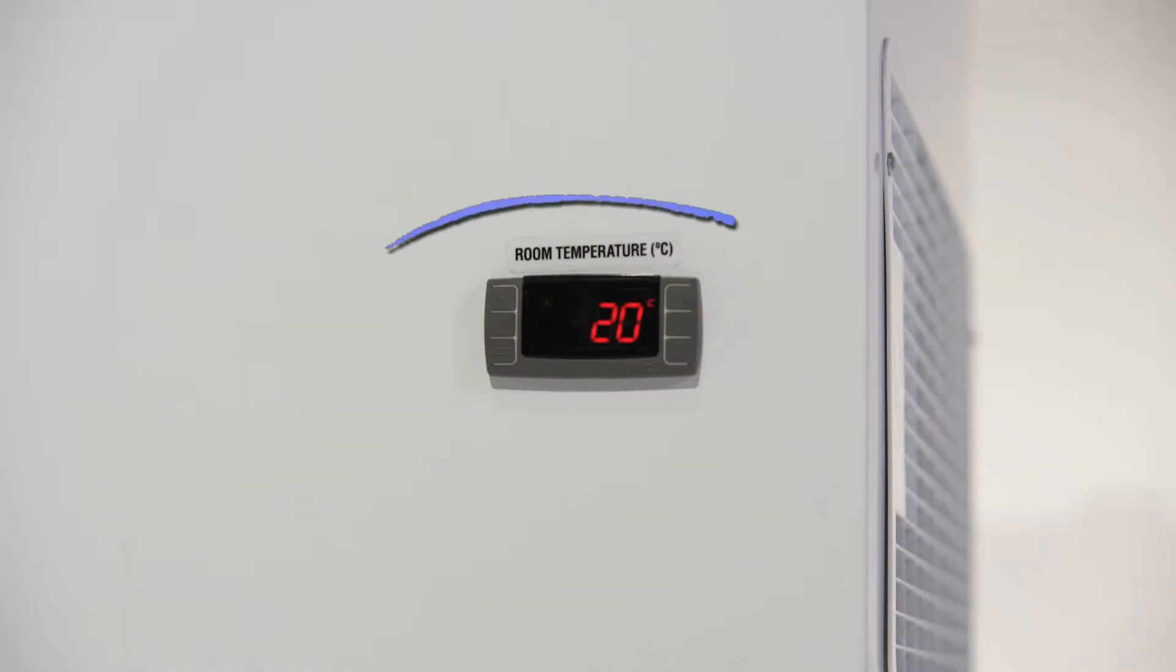Now, there are a few features I'd like to show you. Like the lower right front display. This shows you the room temperature.